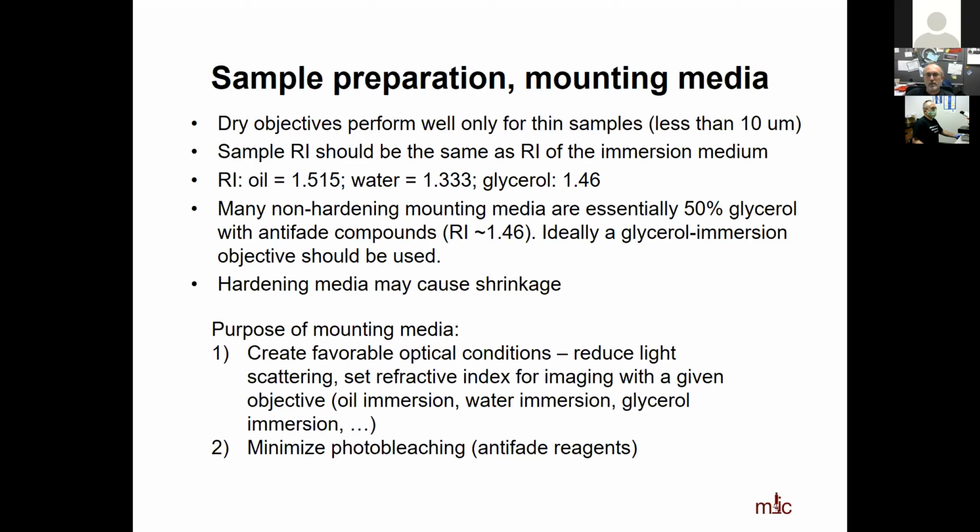But of course, if you have samples that are mounted in something like glycerol or some of those commercial mounting media, they will probably have a refractive index around 1.45, 1.46. And for that, you may use an oil immersion lens, but it's not a perfect match. Ideally, you would want to use a glycerol immersion objective. Or if you have a microscope with oil immersion lenses, then you'll find a mounting medium that has the right refractive index. You can buy them nowadays.